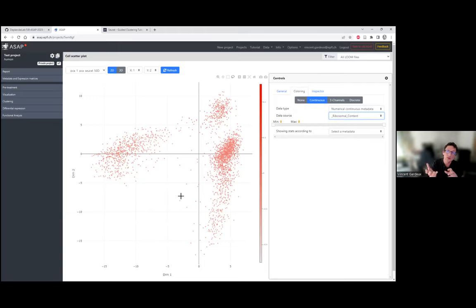So usually this step is used when you have a real cluster, and you want to see if you don't have a huge value of ribosomal content at some place. And you also have the protein coding content and stuff like that.